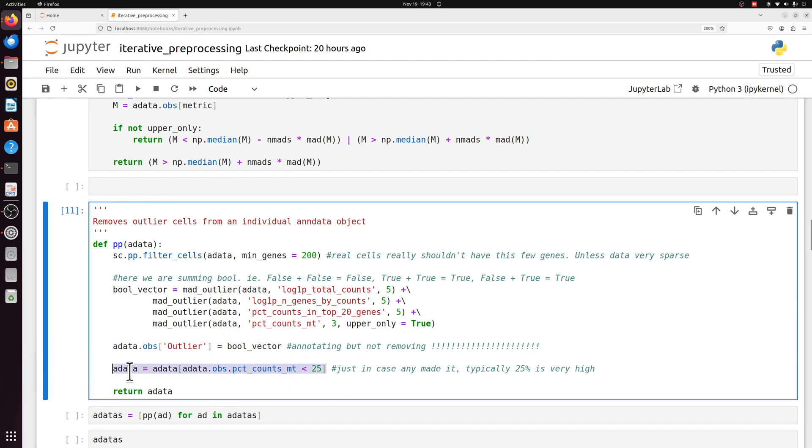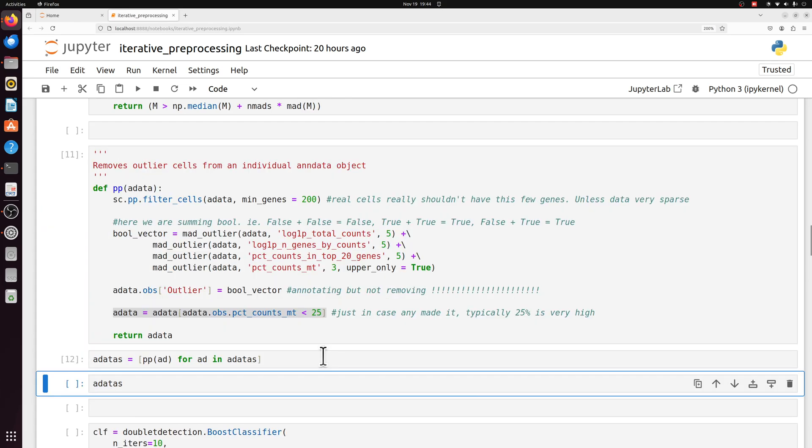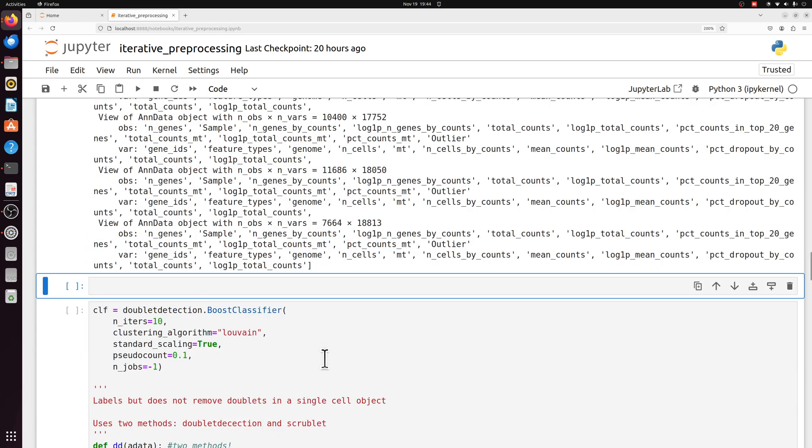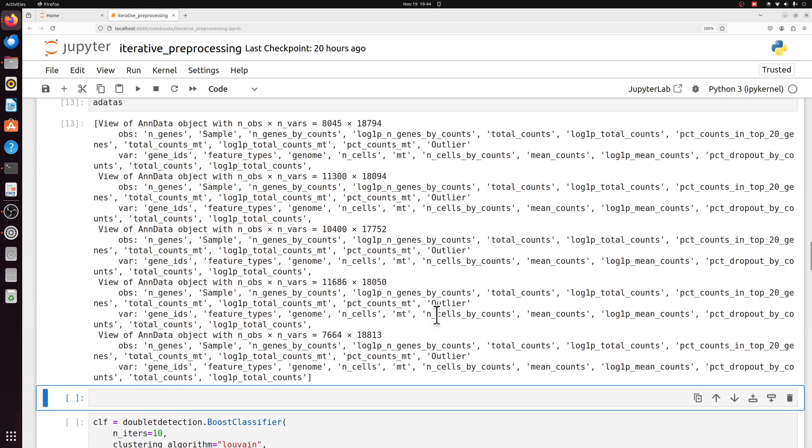We are getting rid of mitochondrial counts that are above 25%, so we're going to pass it through that. And we basically have the same number of cells.